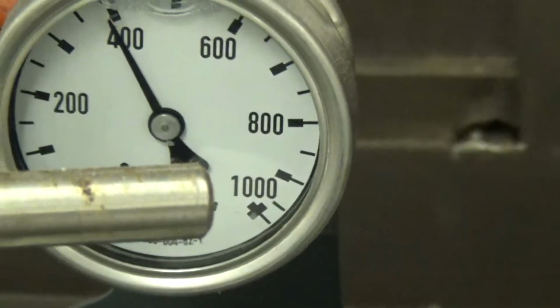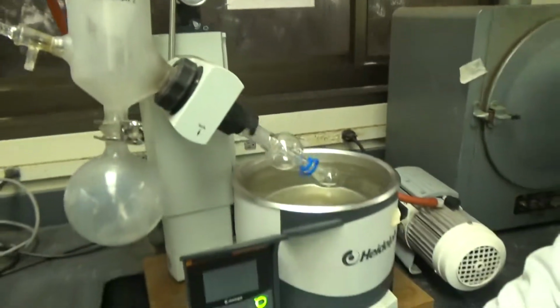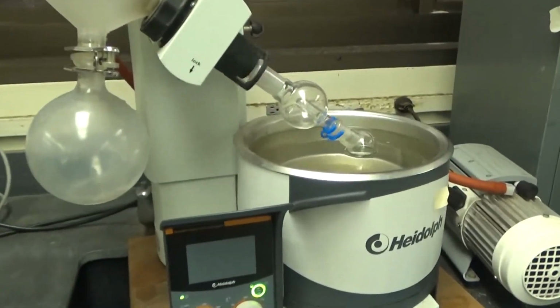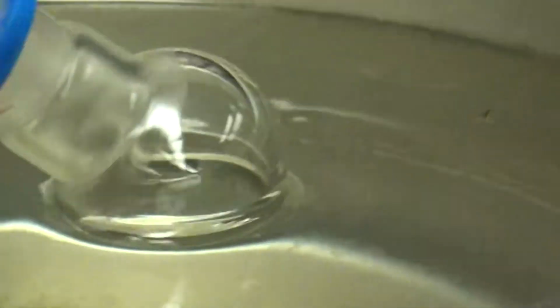400 millibar is like the perfect number for methylene chloride. And so you can see that it's getting concentrated. There's less liquid.